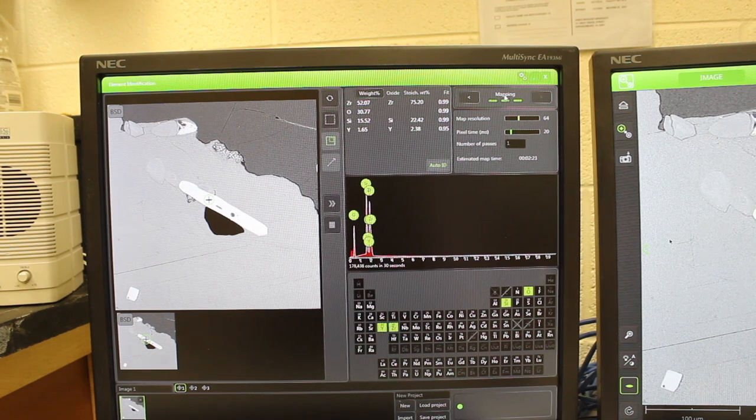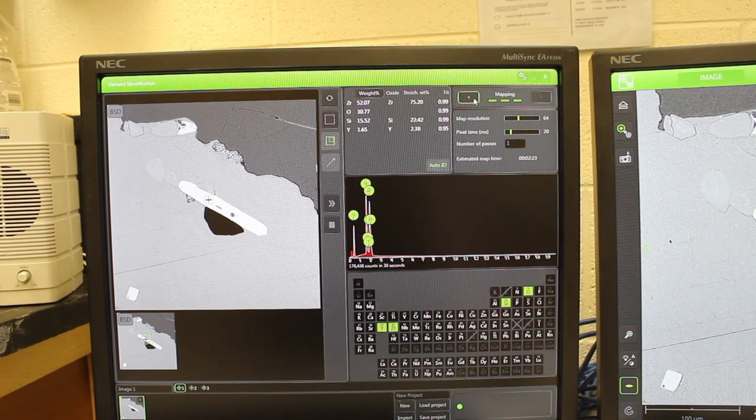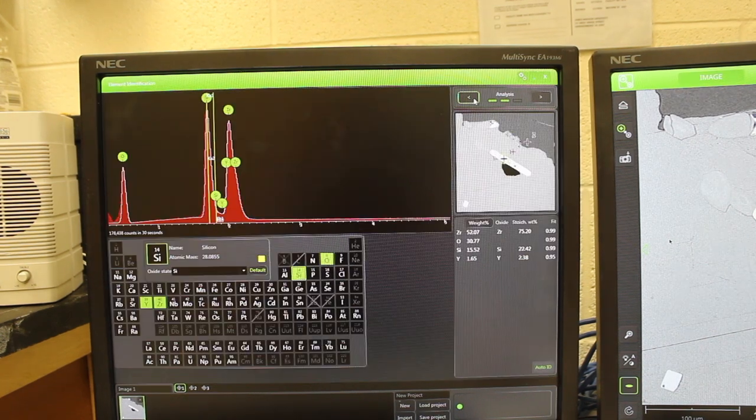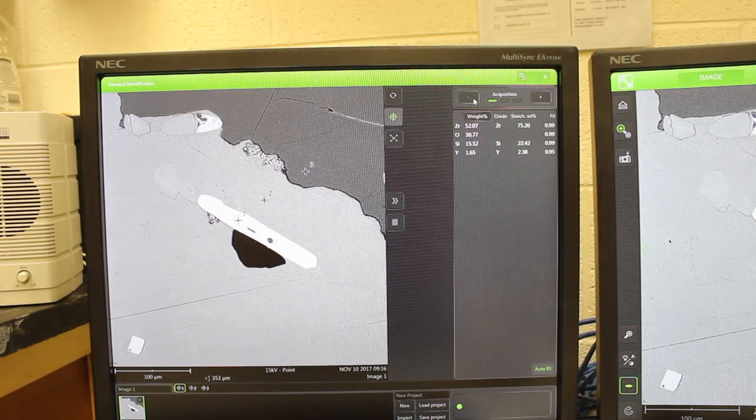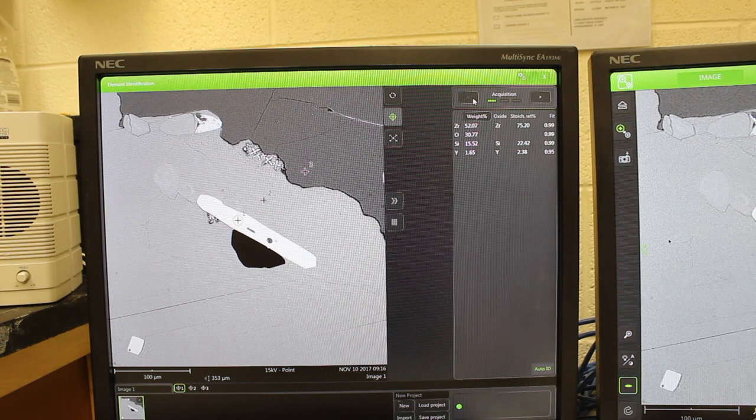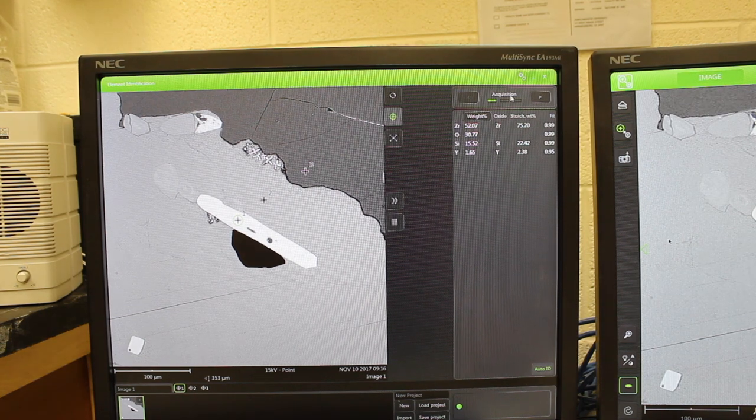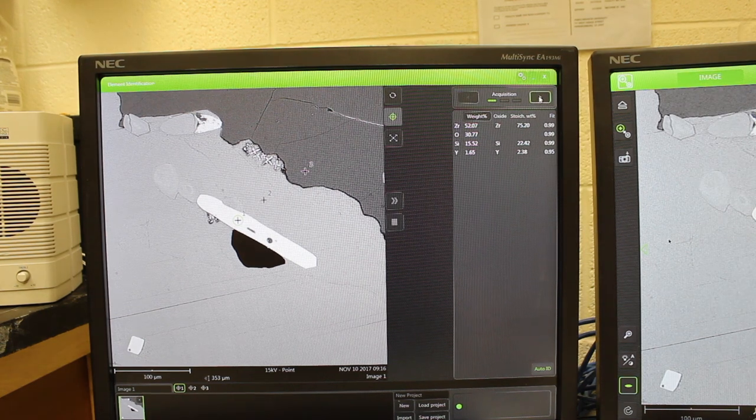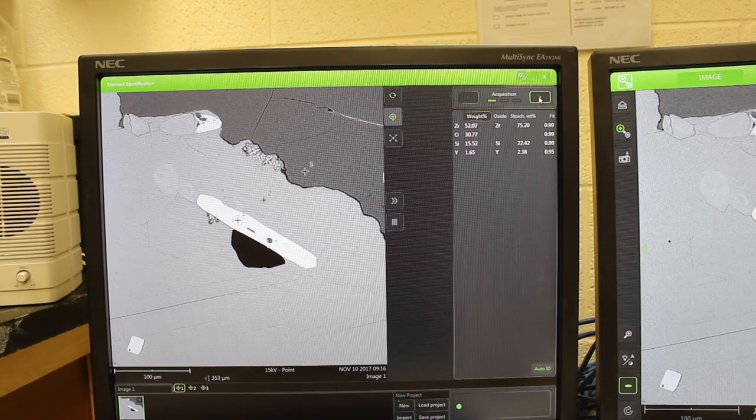If we go to the third window, so we go back to the first, this is the first, the acquisition window for single point analyses.